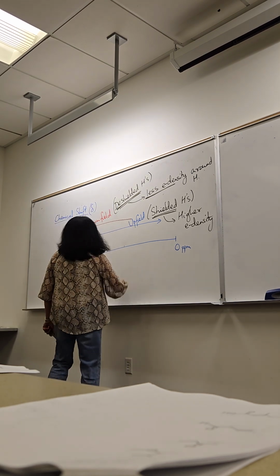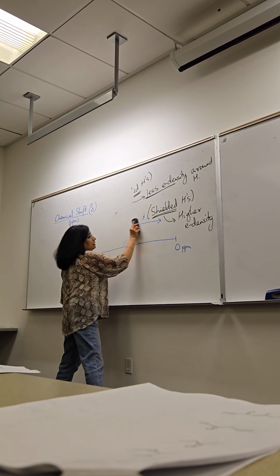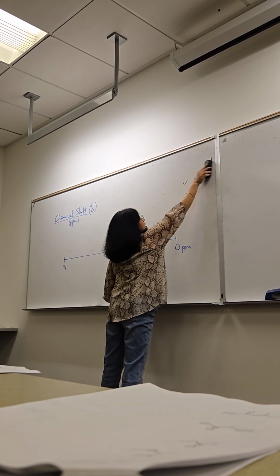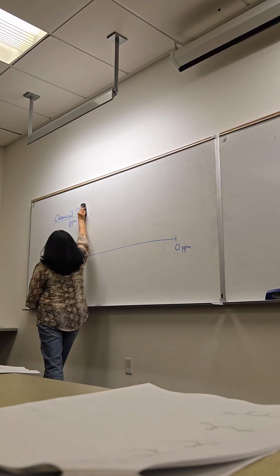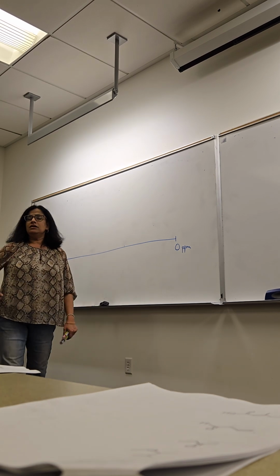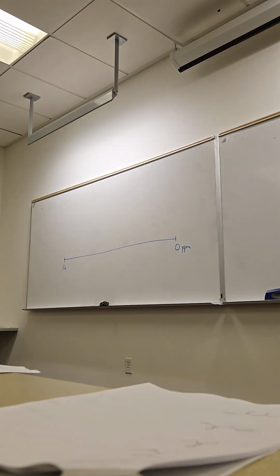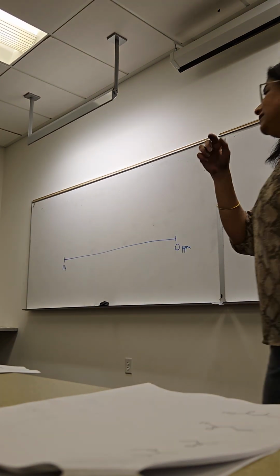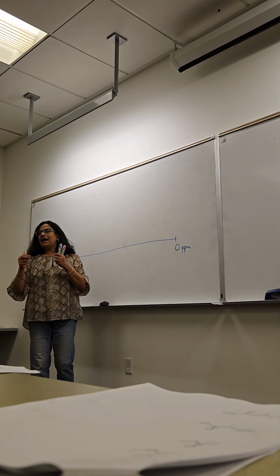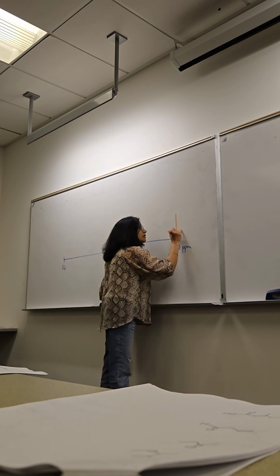No. Okay, cool. Can I erase this stuff? Yeah. Okay. Now, here's the thing, and this is all you will be doing in lab next quarter. The first lab next quarter is NMR. How do we know where zero is? The instrument doesn't know. We have to tell the instrument this is zero, and then the rest is relative to that. So how do we tell the instrument where zero is? We actually add something to our sample. We add a reference.